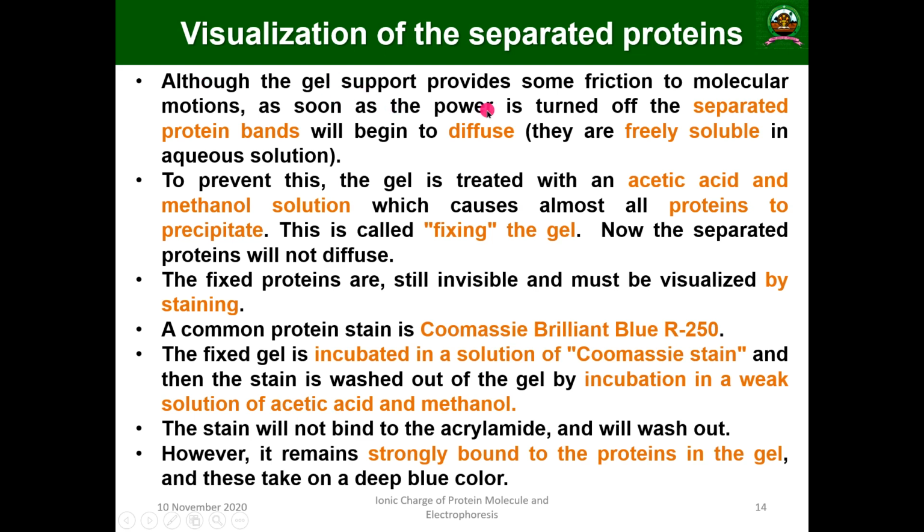Although the gel support provides some friction to molecular motion, as soon as the power is turned off, the separated protein will begin to diffuse. So once the power is turned off, what will happen? Through the gel, there is a possibility to diffuse, because the proteins are freely soluble in aqueous solution.